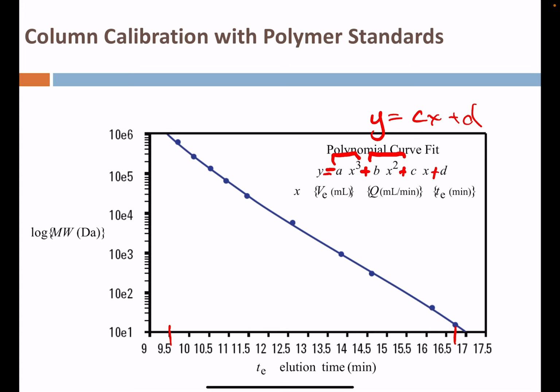So as you can see here, the curve with a polynomial is allowed to have a bit of curvature on the ends, and this allows us to push the application of the GPC column to further territory on the left and y-axis limits here. Okay, common mathematical approach to opening up the availability here to use our column over a wider molecular weight range.